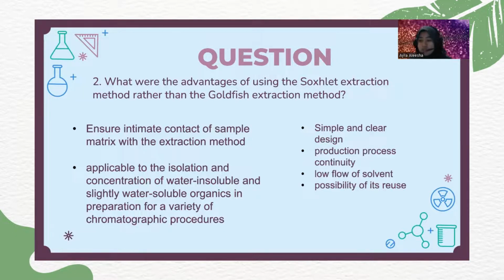Lastly, it is also possible to reuse the solvent after stripping and distillation. It has a simple and clear design, production process continuity, low flow of solvent, and possibility of its reuse, like I said previously.